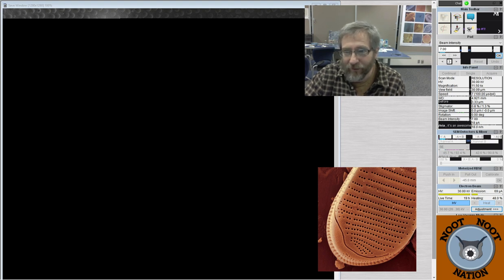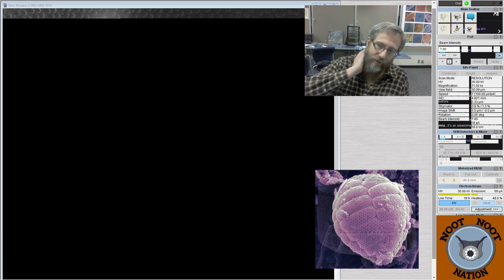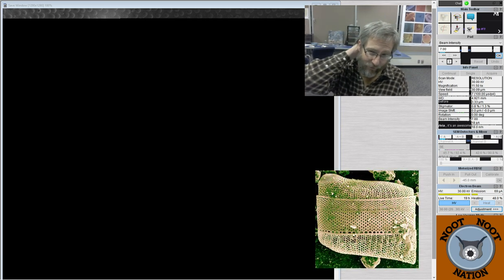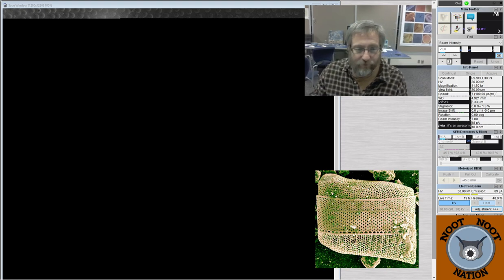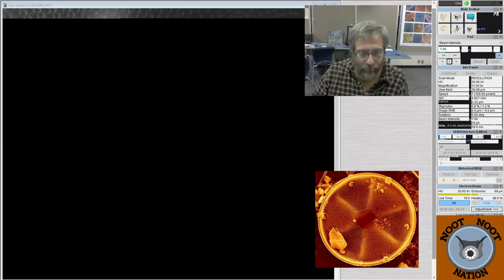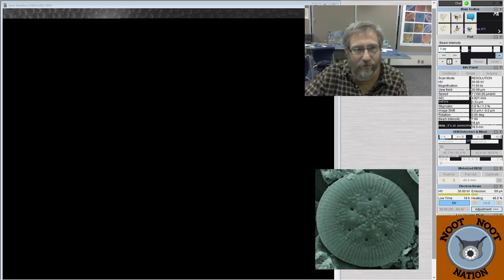Staurosira do chain together, yes. Did diatoms change during the millions of years? Yes, diatoms will evolve over time, for sure. Good morning, Dell. What's the reason for such small organisms to evolve? Diatoms evolve like anything else. They evolve because they need to respond or adapt to changing environments. Most kinds of evolution for diatoms probably happen when a new environment is created in a system that didn't used to have that type of environment. Think of it like an opportunity, so they'll evolve so that they can move into that new environment.